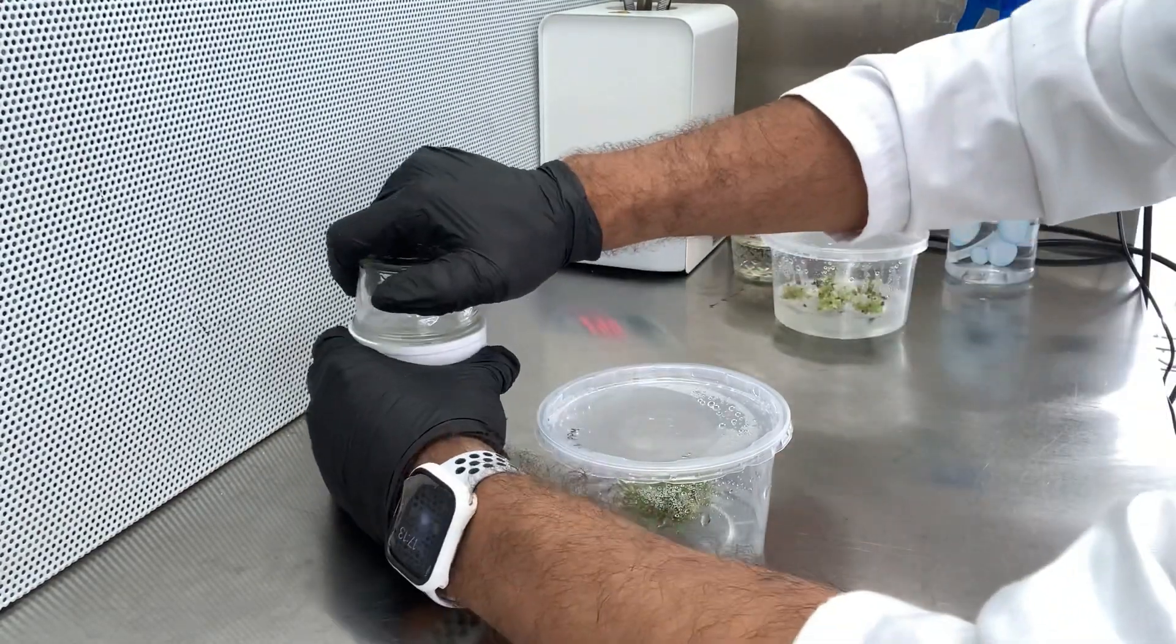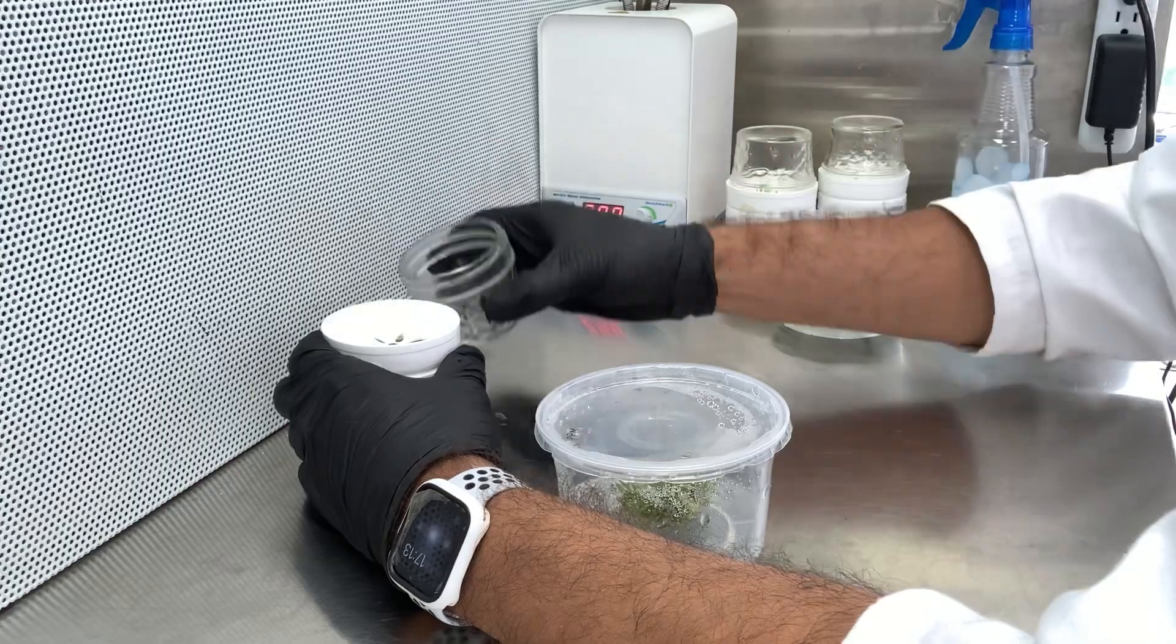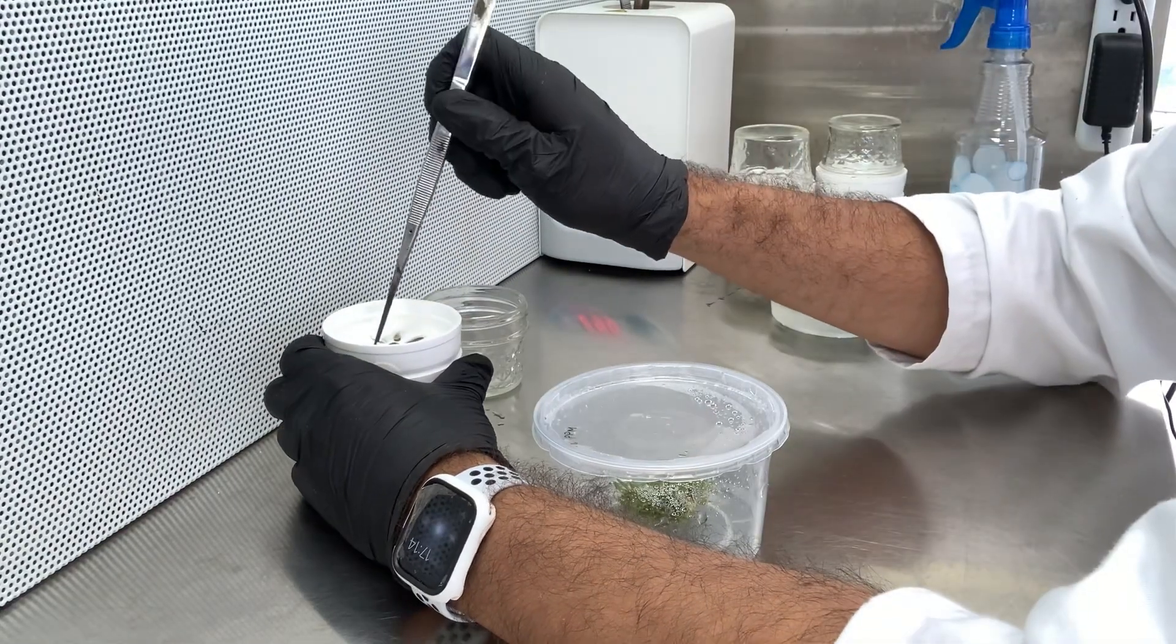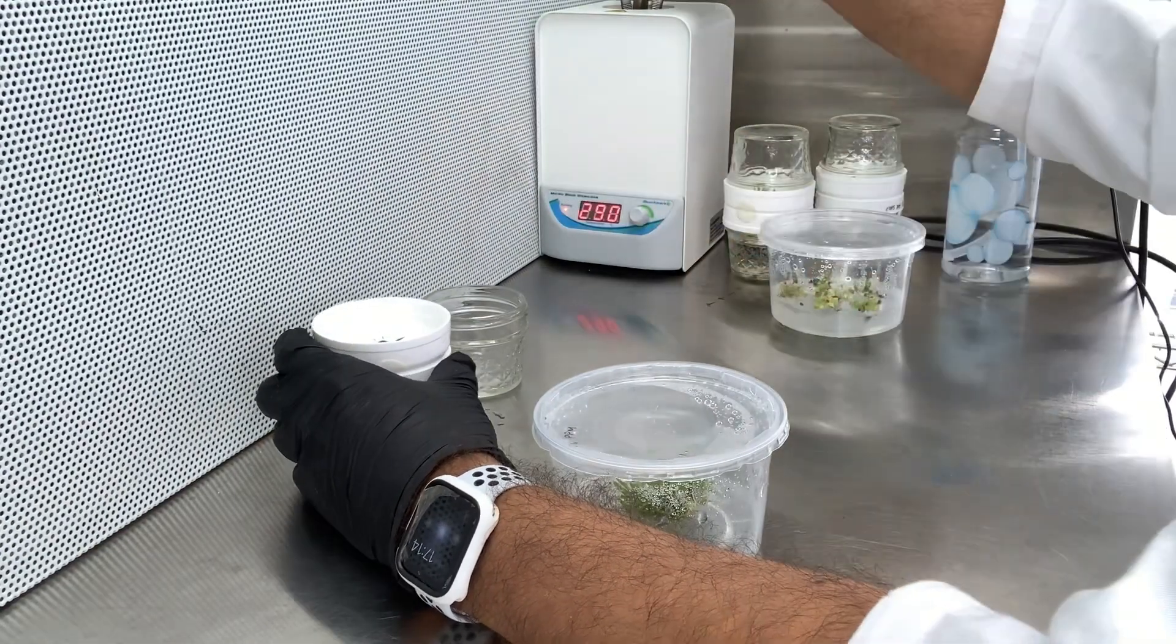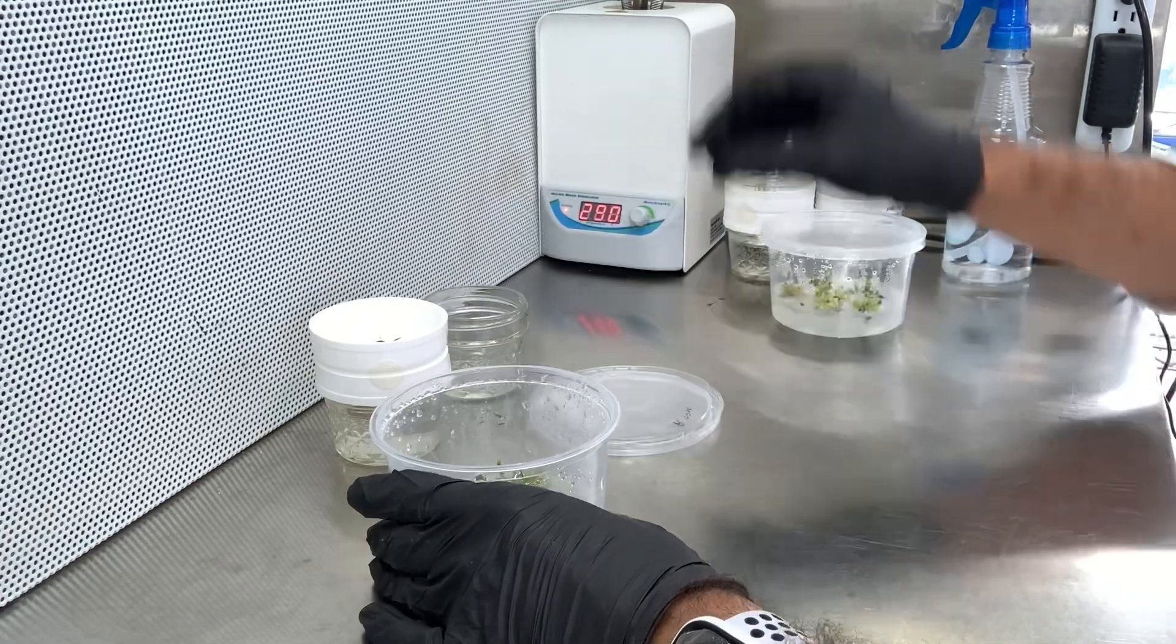It is very effective and practical to use hundreds of biocouplers Temporary Immersion Bioreactors to produce thousands, even hundreds of thousands of plants every year.